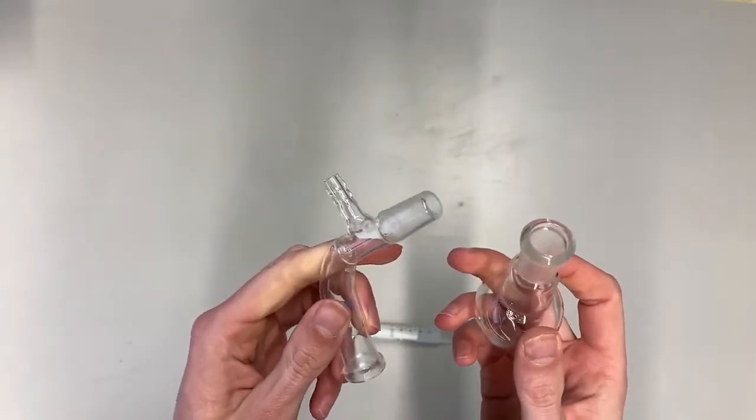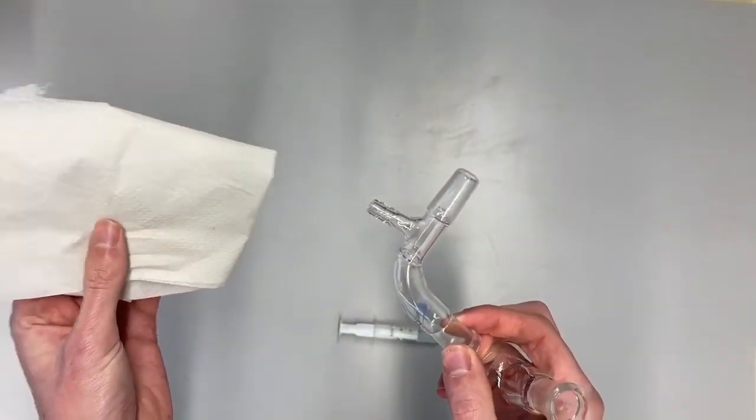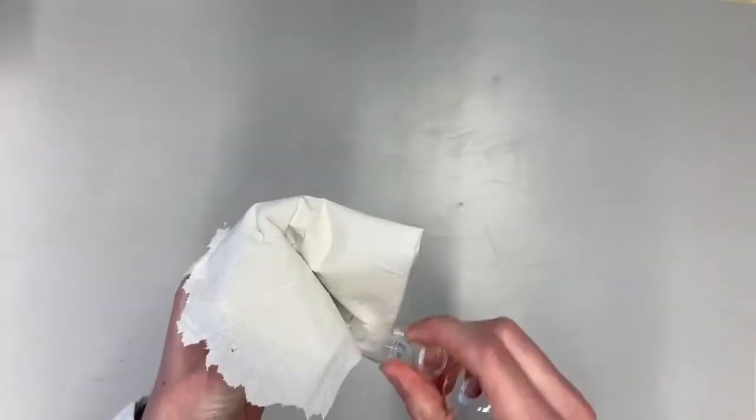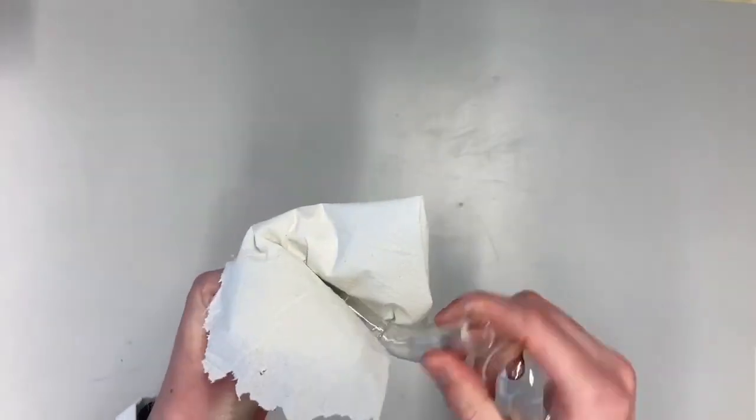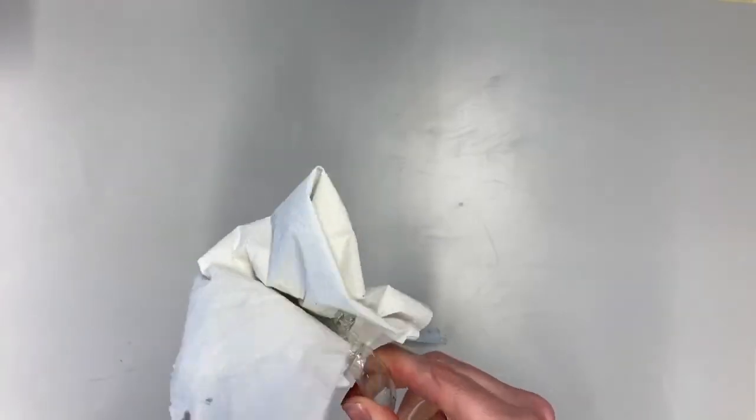So if you have joints that are fully greased you can clean them with a bit of tissue. And even if it's really bad you can clean them with a bit of tissue and some pentane, and then the grease should dissolve in the pentane.